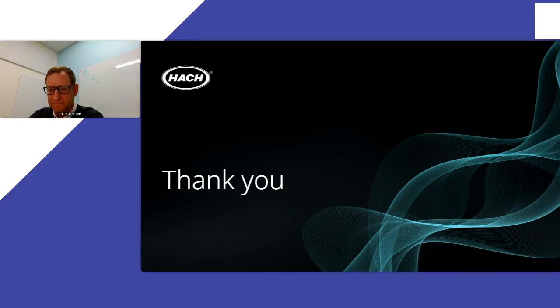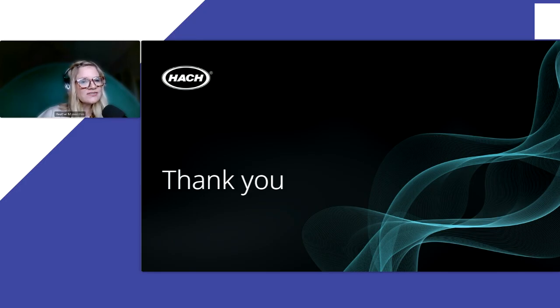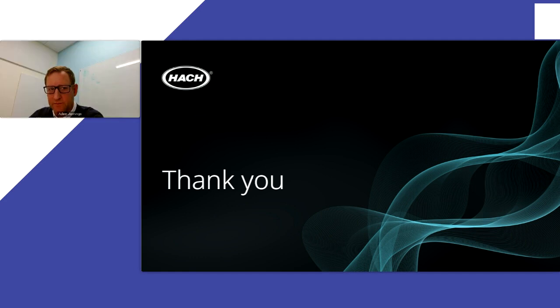Okay, very good. Thank you so much, Adam. And the next question is asking, can you please verify if the online measurements for ammonia is for process control only and not for compliance monitoring purposes? Thank you. Yeah, really great question. In the U.S., we don't have any online ammonia monitoring technologies that are approved for regulatory reporting, to my knowledge.